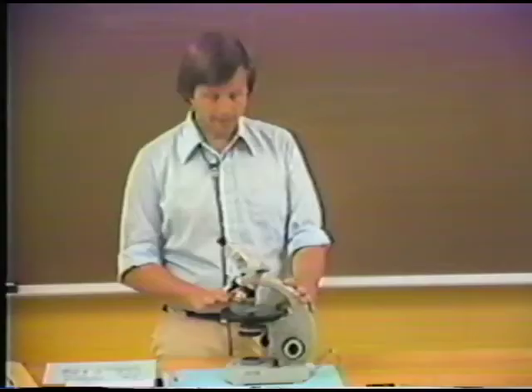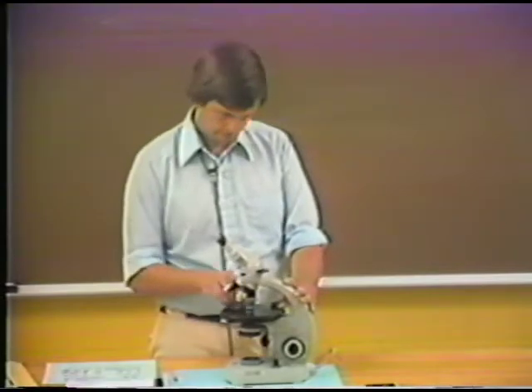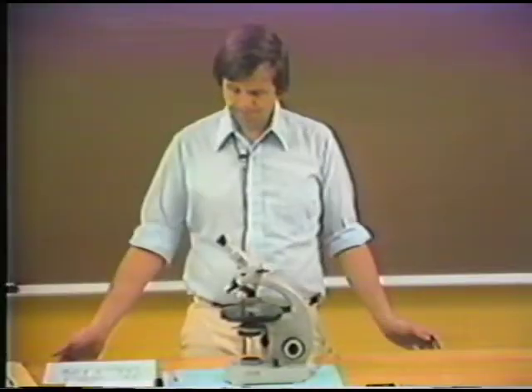Uniaxial flash figure. Now I'll look at a flash figure, for example, on the mineral calcite, which has, of course, higher birefringence. And you can see that the character of this flash figure is very, very similar to the character of the flash figure on the quartz grain. So, uniaxial flash figure. But what happens if we have a more or less random kind of orientation?